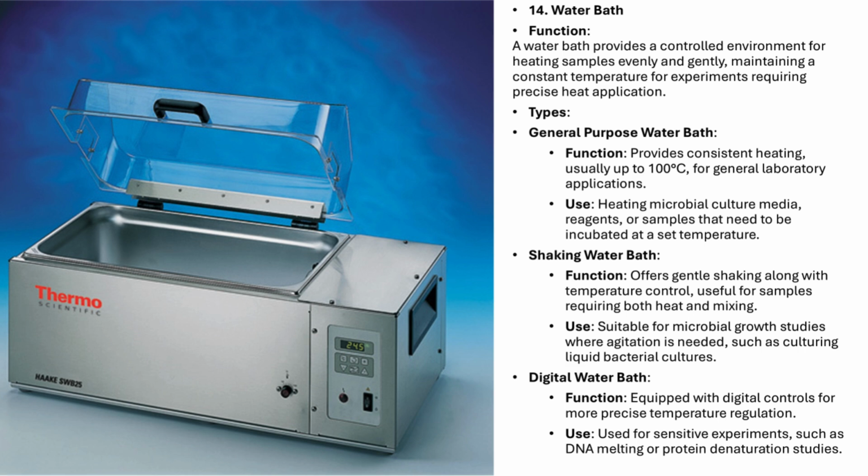Digital water bath. For more precise temperature control, the digital water bath comes equipped with digital settings for accuracy. This is perfect for sensitive experiments, like DNA melting or protein denaturation, where maintaining the exact temperature is crucial.